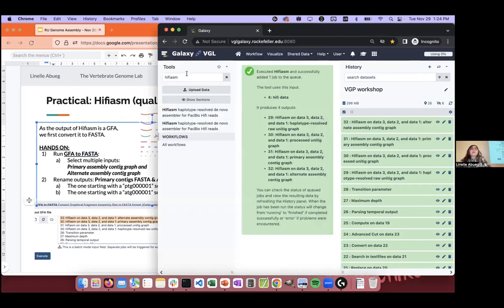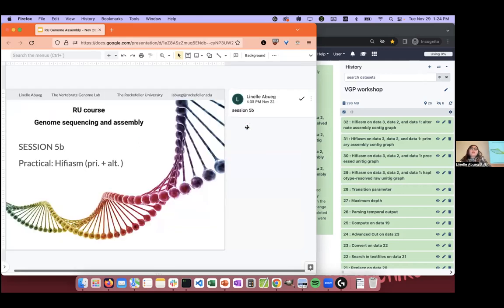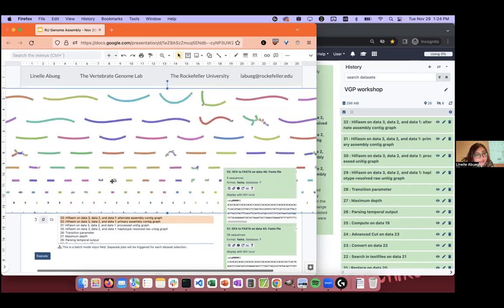What are the overlaps? The overlaps between the different nodes. They represent the regions where there were multiple potential overlaps in the graph, so you couldn't decide where to go. In GFA, they're still represented as a graph, but because you cannot resolve them, you just drop all the overlaps, trying to find one easy path through. Those can be interpreted as heterozygous regions.